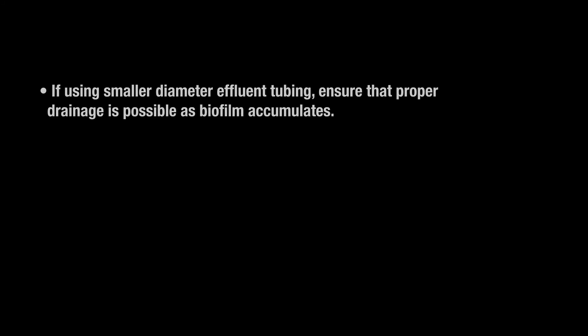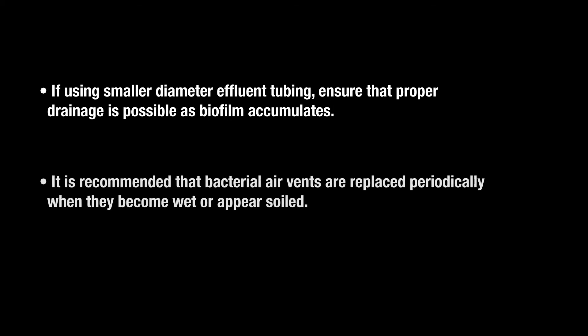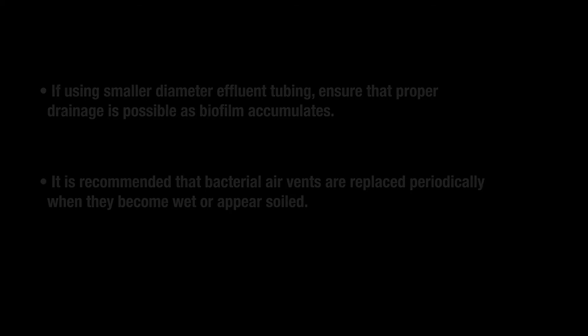If using smaller diameter effluent tubing, ensure that proper drainage is possible as biofilm accumulates. It is recommended that bacterial air vents are replaced periodically when they become wet or appear soiled.